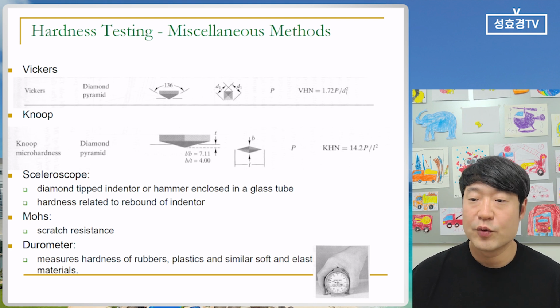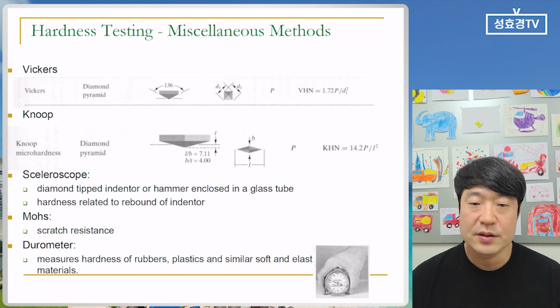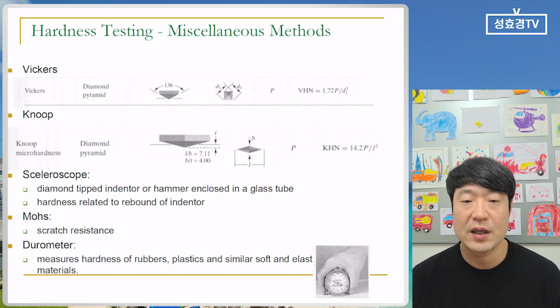Usually I'm conducting the Vickers hardness test. Many people in companies and industry sometimes prefer Brinell and Rockwell because they can understand that kind of macro-scale hardness test. But in laboratories or schools, where we are doing this just for research, we really focus on very small sizes. Because in the microstructure, maybe there are some precipitates and different types of grain behaviors, and we want to understand that.